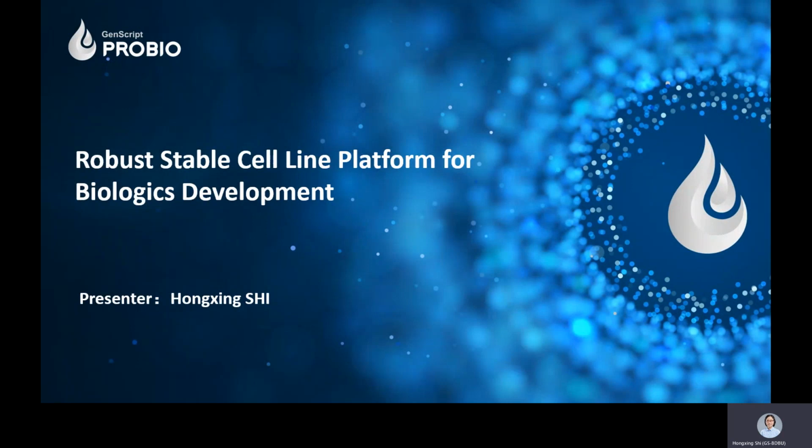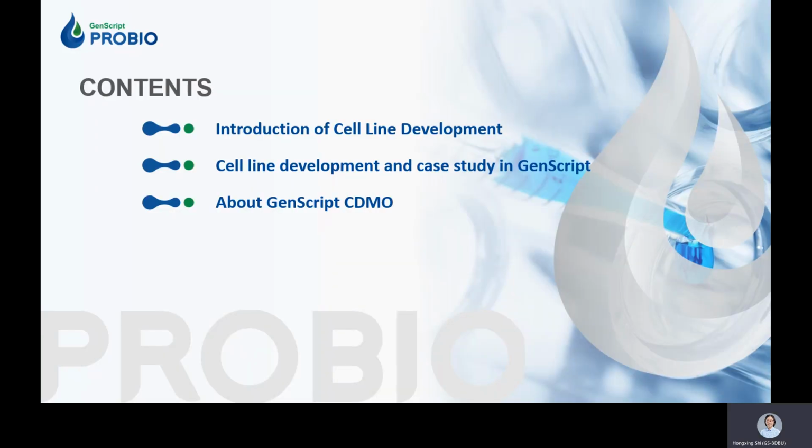Today it's my pleasure to give you a webinar on the topic Robust Stable Cell Line Platform for Biologics Development. I'm going to talk about the following today. First, I will give an introduction to cell line development, and then I will introduce the workflow of cell line development and give some case studies from ProBio. And last, I will give an introduction about GenScript ProBio.